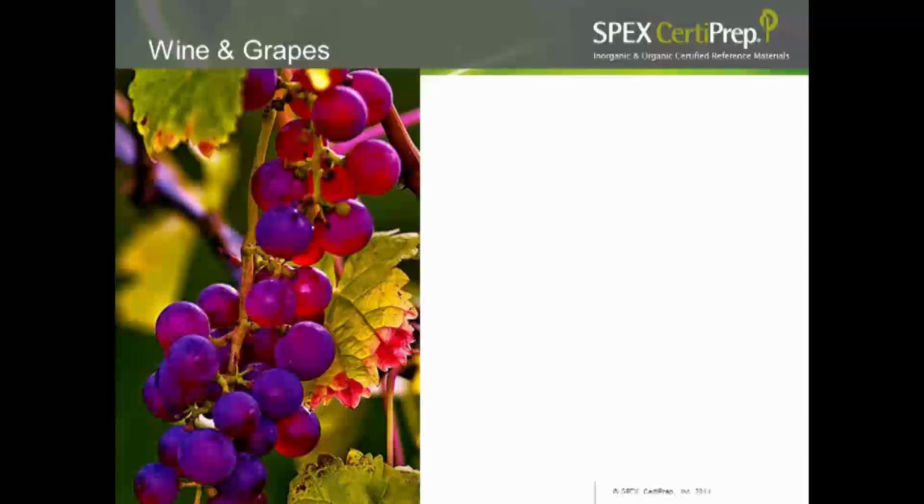In our wines, we did see a variety of different pesticides. The most dominant pesticides were carbaryl at about 3.7 ppm, found in most of our wines, and the imidacloprid at about 2.8 ppm, also in most of our wines. Then we saw a variety of different pesticides in 1 to 2 of the wines, the ethion, the bifenthrin, and so on. One of the surprising things that we found was we did not expect to find an increase by using the shaker on a liquid product.